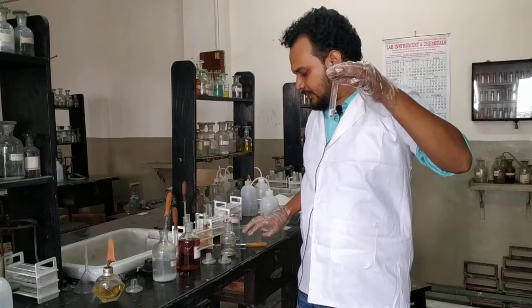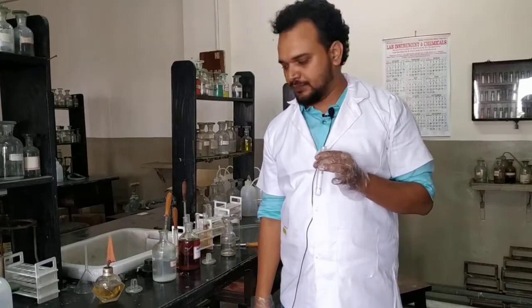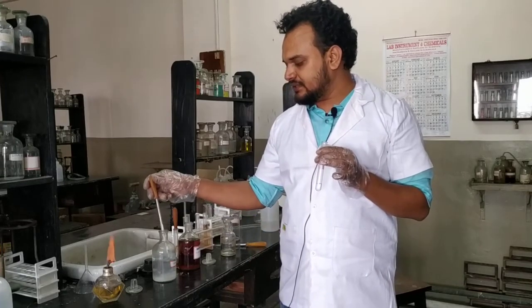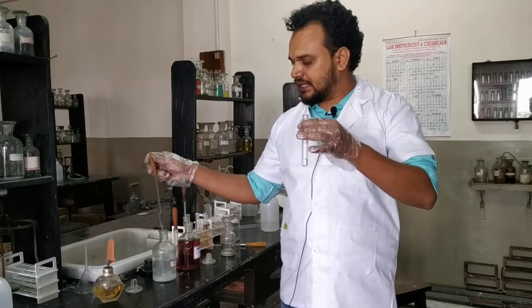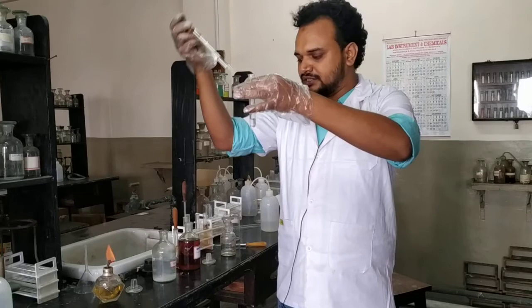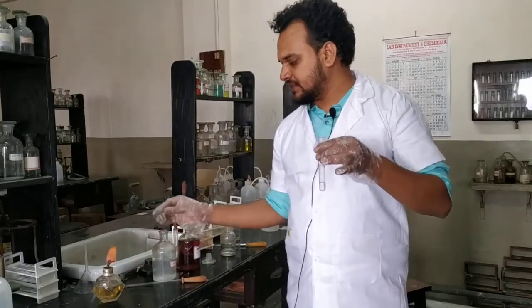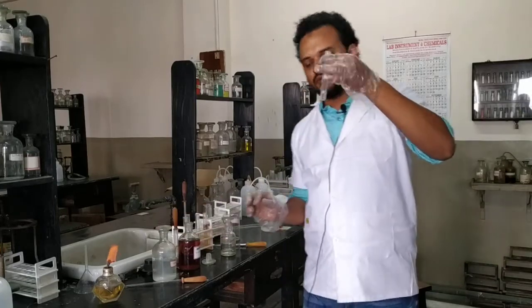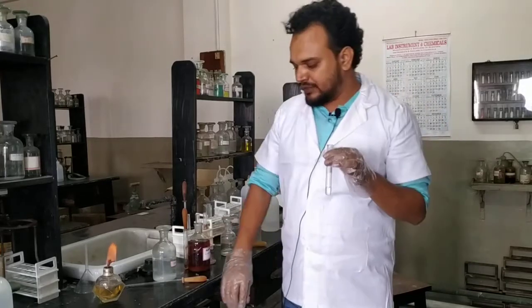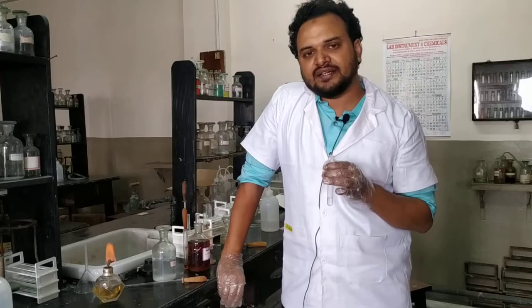The reaction will take place in alkaline medium, so to make it feebly alkaline we add only two drops of dilute NaOH. Shake well for mixing, and now we will add only 4 to 5 drops of sodium nitroprusside solution. After that we will heat it.